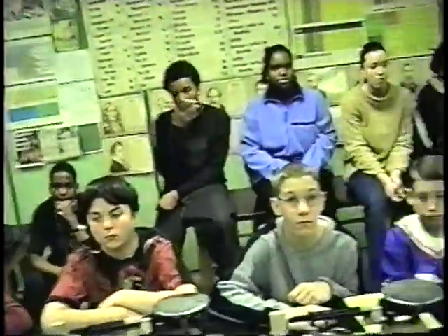We're using vinegar instead of water. And what else? You're right, you got half of it. And we're using marble instead of salt. Yes, so in other words, what makes part 2 different than part 1 is we're using different chemicals. Okay, so let's talk about the chemicals that we're going to use.